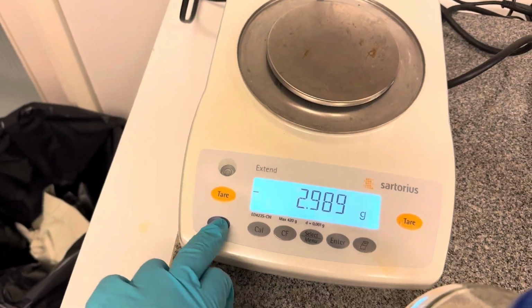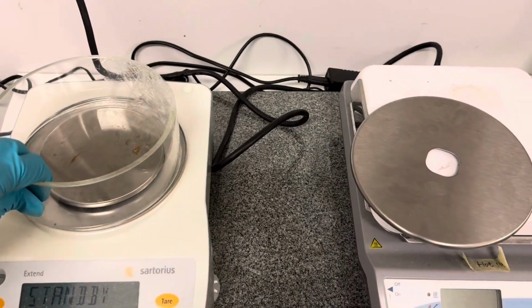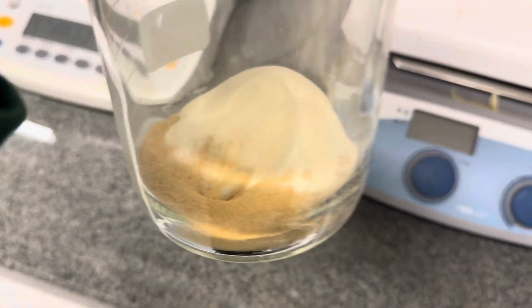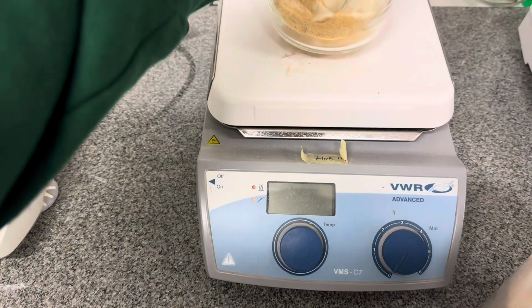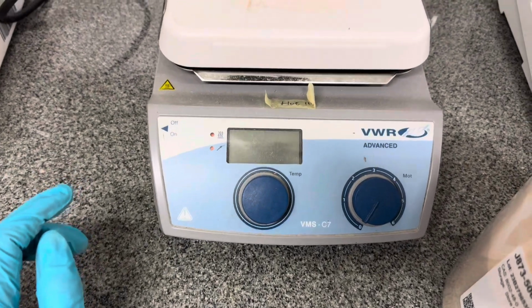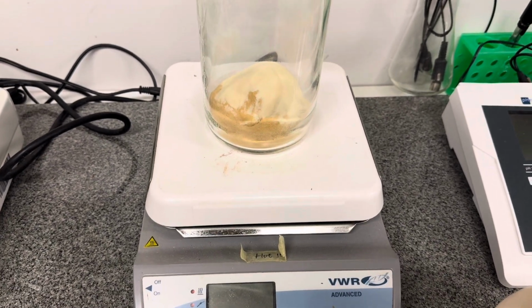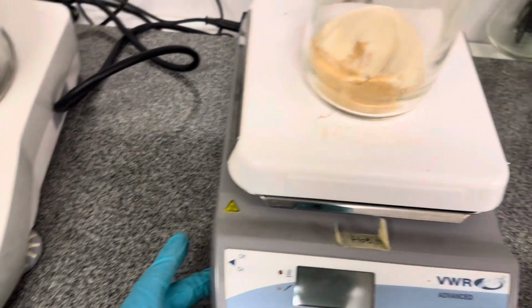Before I explain, I turn this off. The purpose of this magnetic bar is that when I put the water inside the bottle and place it on this machine, which rotates this magnetic bar, it helps in dissolving malt extract and agar into the water. Let's see if it can work even in the dry condition.